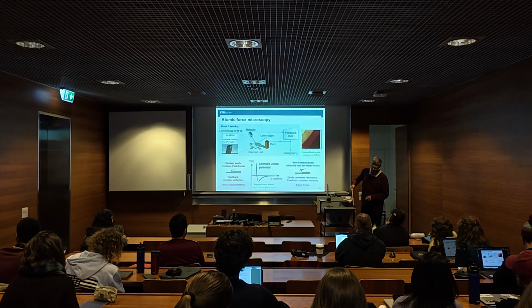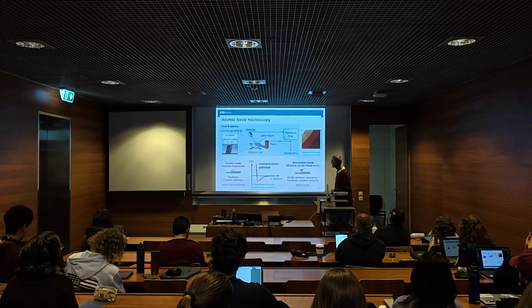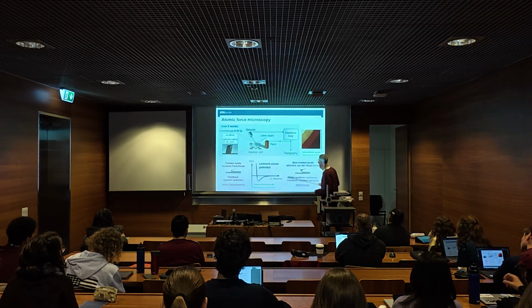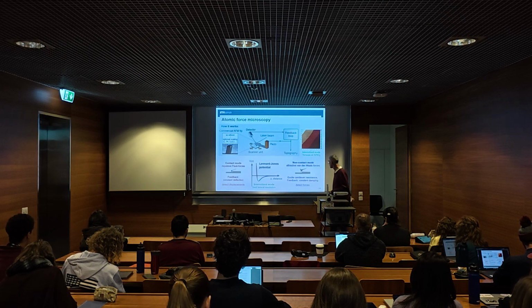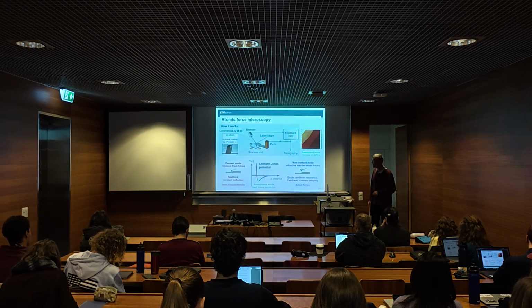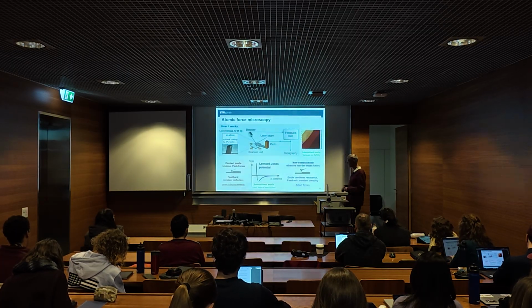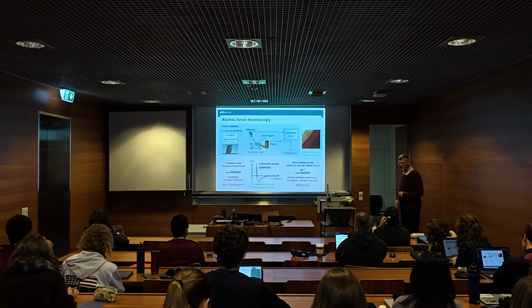So these two modes are called contact mode and non-contact mode. Here you feel the repulsive Pauli forces, so that branch basically, and here the attractive van der Waals forces, so that's basically what you work with here. And depending on what you want, you can use one or the other mode. And here you see nicely the atomic terraces, the atomic steps on the surface of the strontium titanate. So it's atomically sharp in the vertical direction.